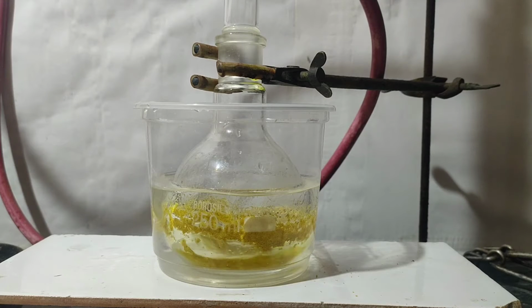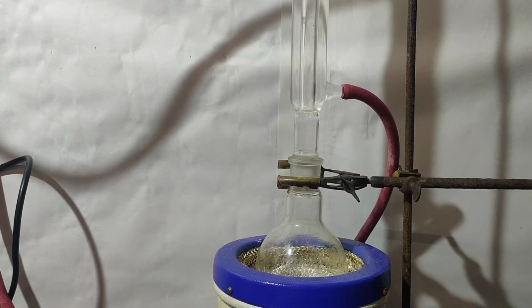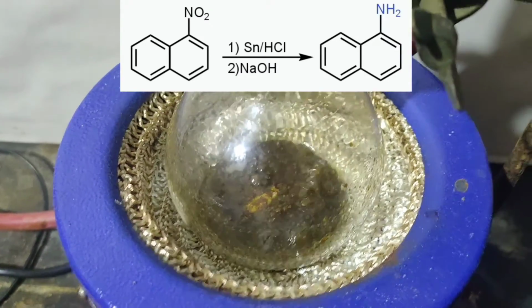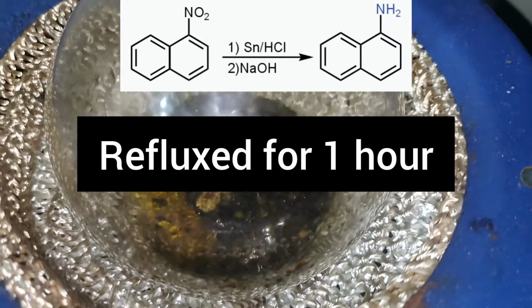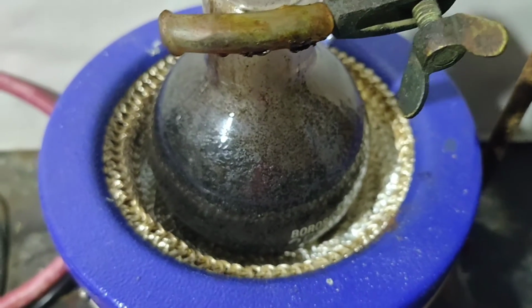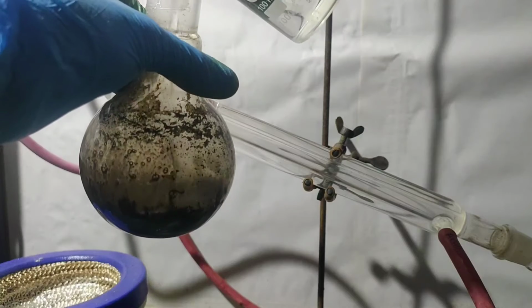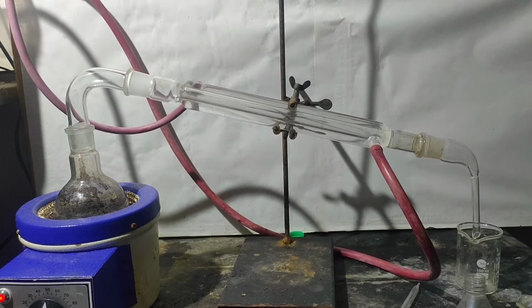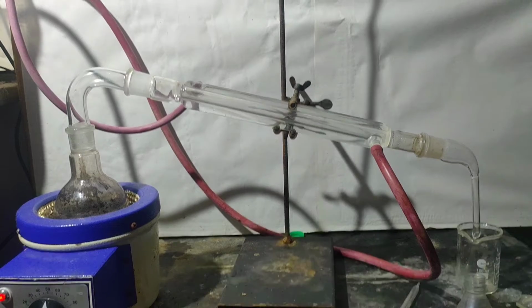But still nothing happened, so I had to use a heating mantle. The reaction mixture turned tarry. It was heated for 1 hour. Then to the flask, around 100 ml of water was added and the residual alpha nitronaphthalene was steam distilled.